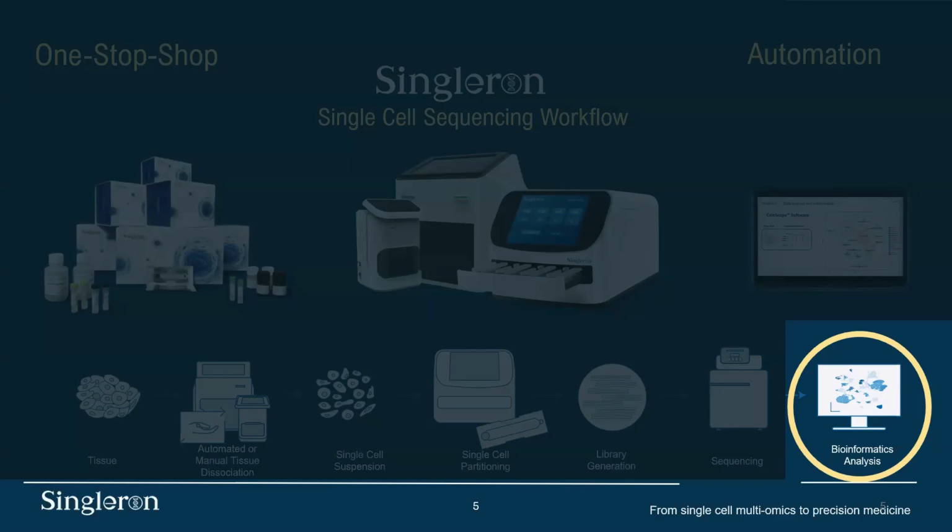Because today, we skip the wet lab and sequencing part and work exclusively in silico. So our starting material is single-cell data, no matter which data format or which platform or technology it comes from.